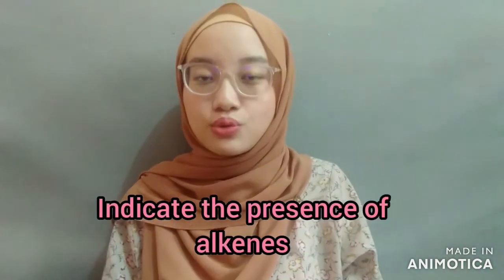So today I'm going to briefly explain to you what the bromine water test is and how I demonstrate this experiment. Okay, so the bromine water test is used to determine the presence of alkenes inside an unknown solution. How bromine water determines if there are any alkenes inside the unknown solution is that it will turn colorless.